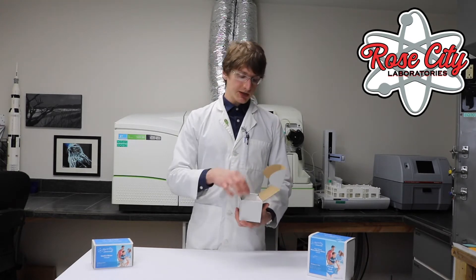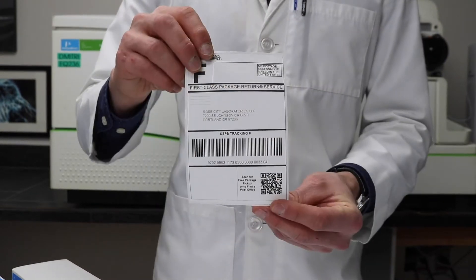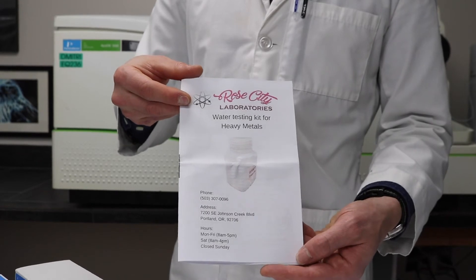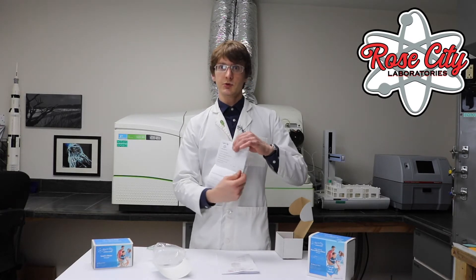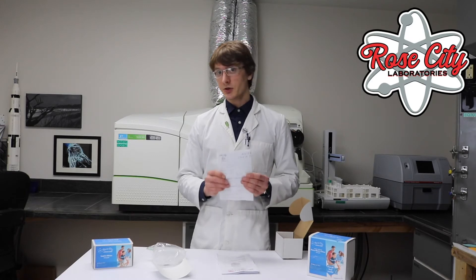Inside one of these kits, you'll find a bottle for collecting your sample, a return shipping label, a set of instructions, and a chain of custody. You'll refer to these instructions while you're collecting your sample, then fill out the chain of custody, which will accompany your sample on the way back to the laboratory. This can also be filled out online.